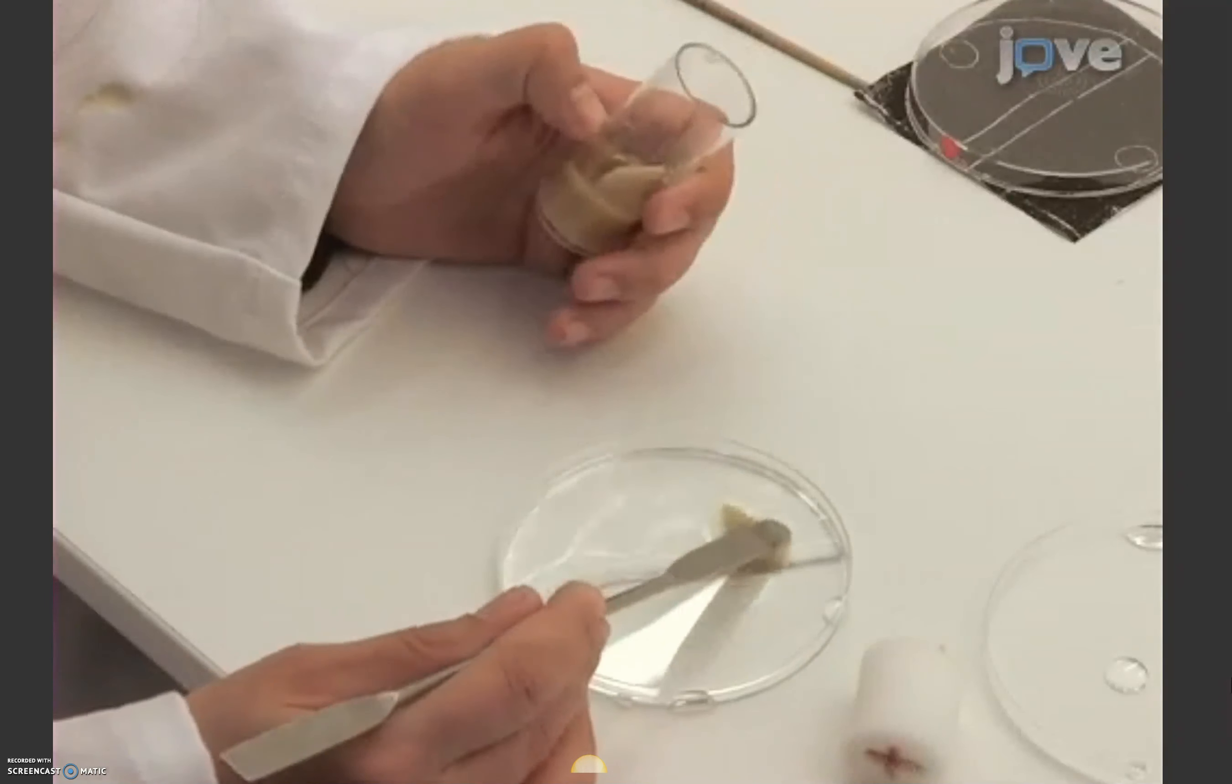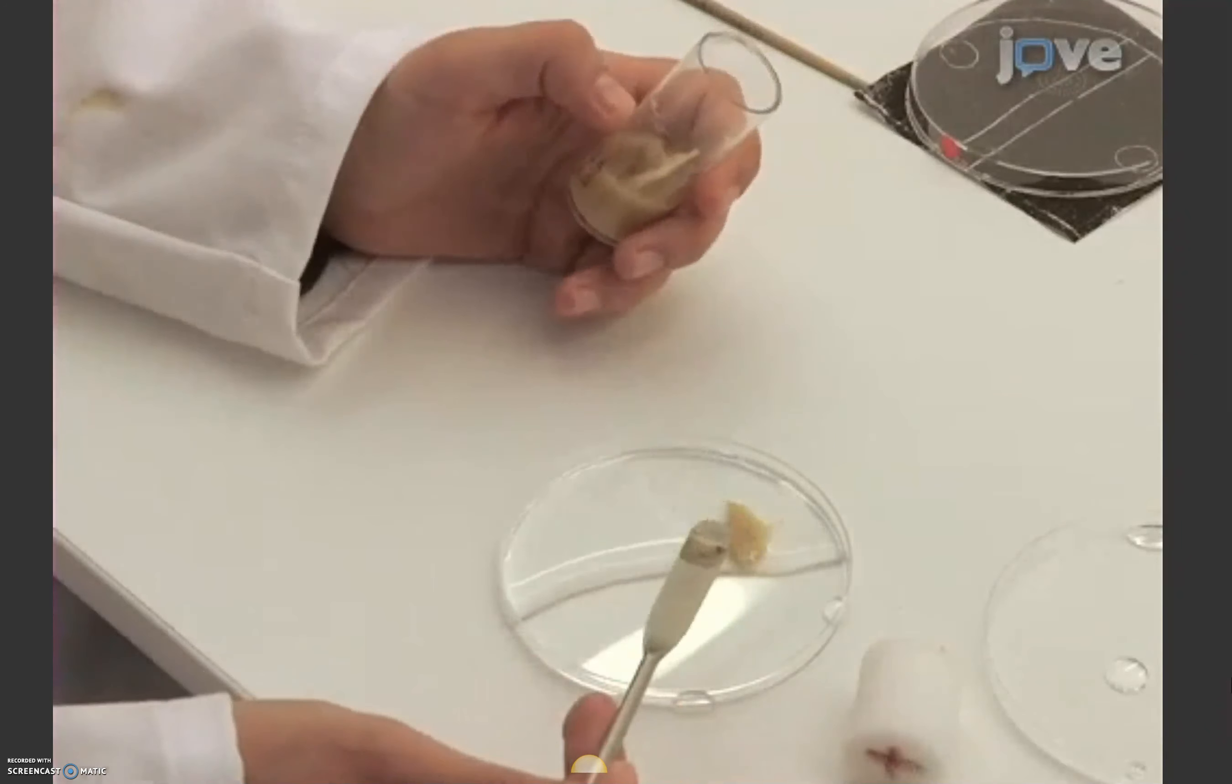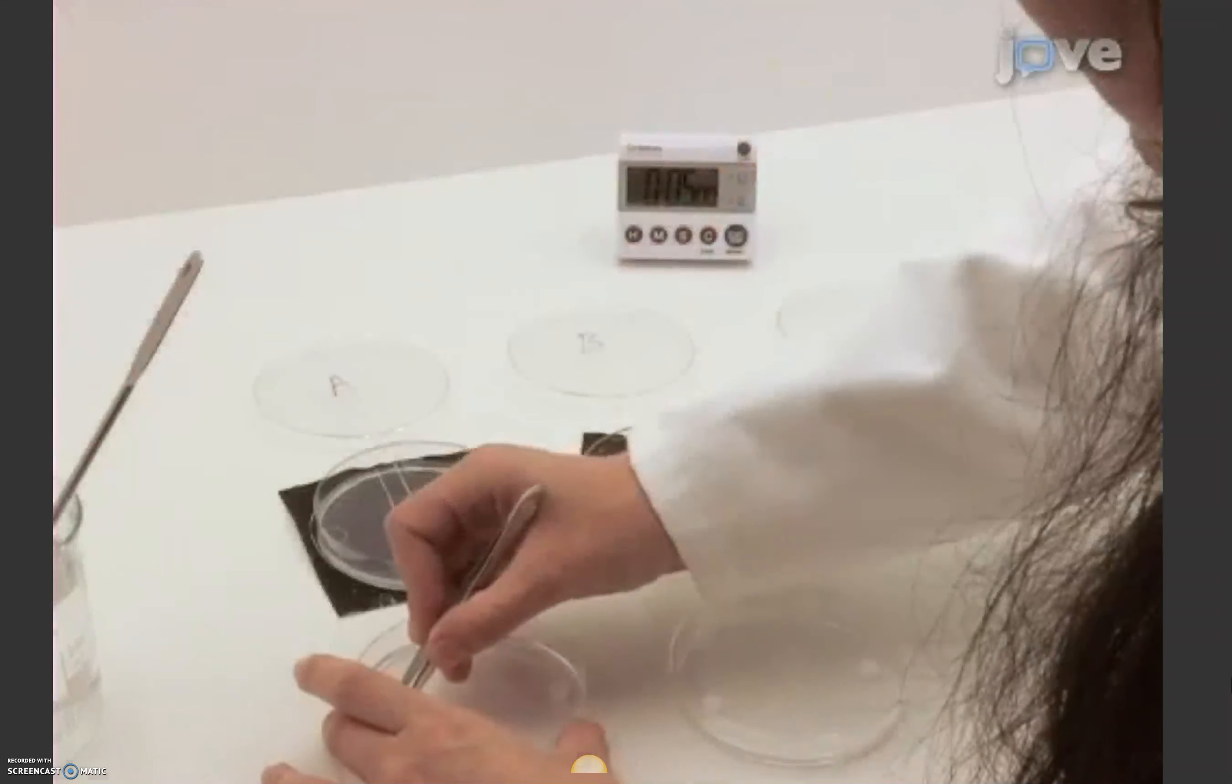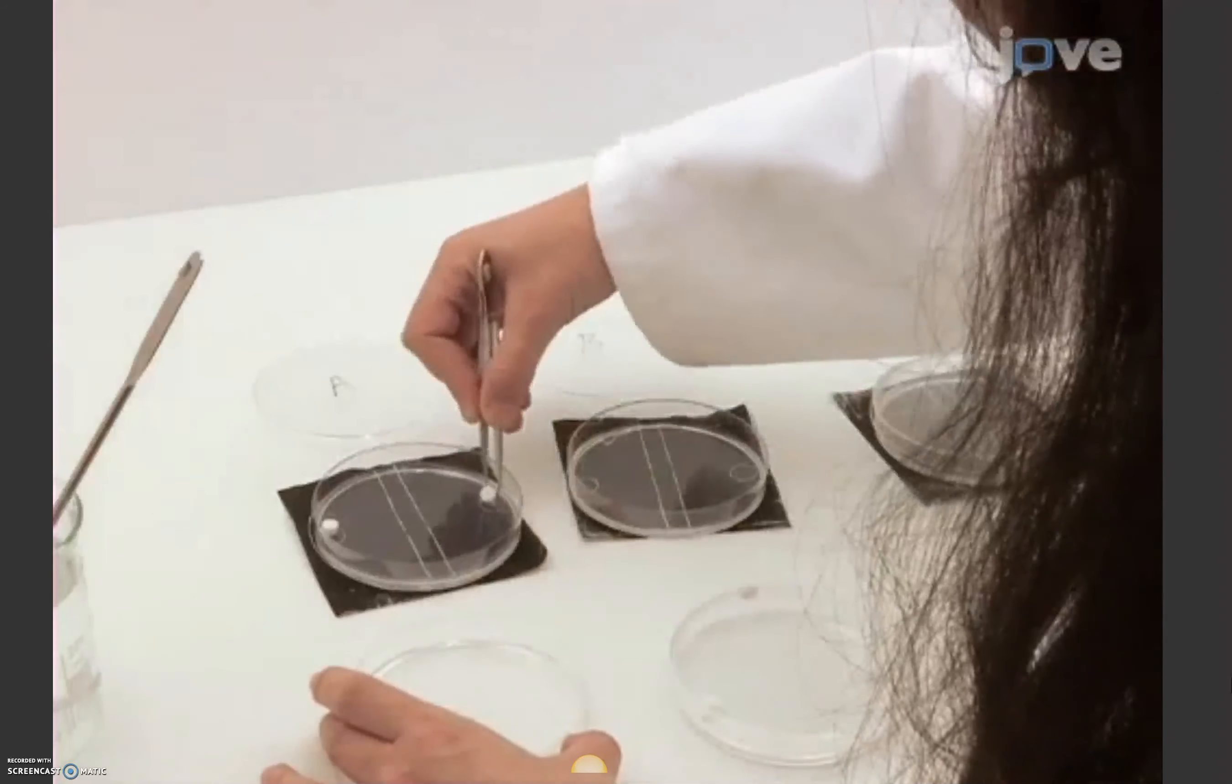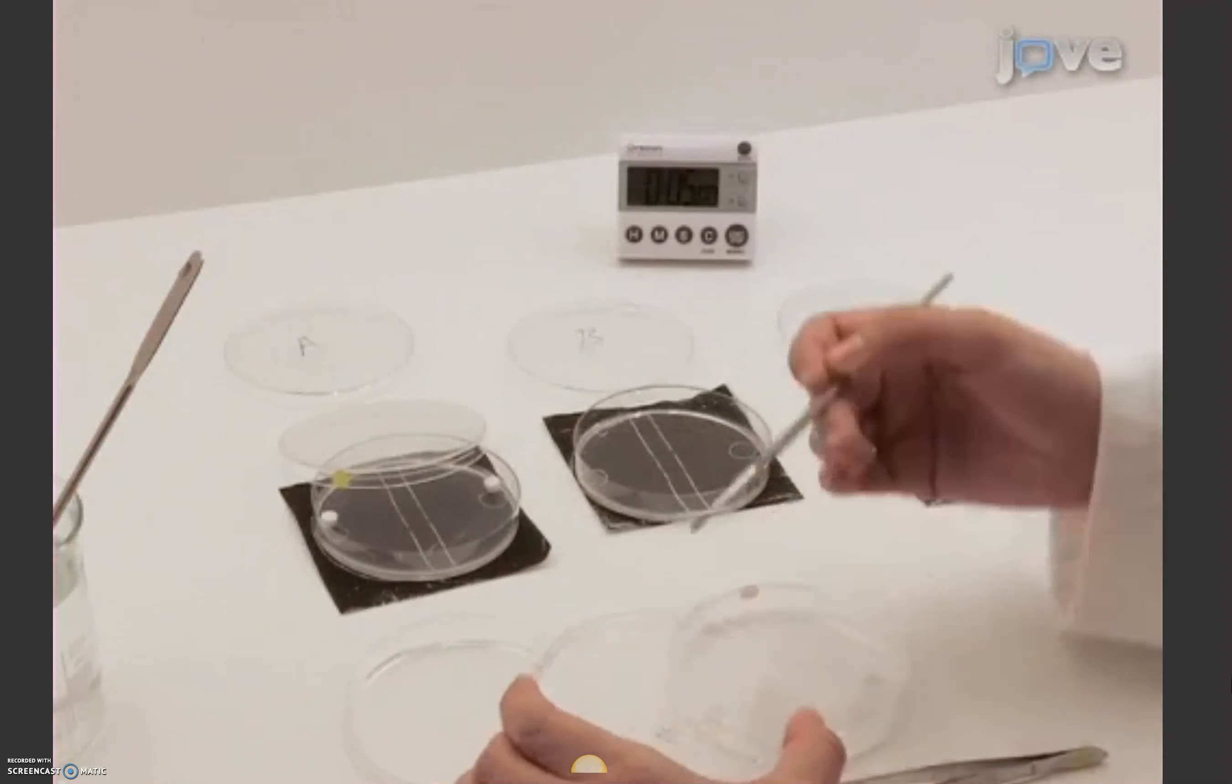Finally, to complete the experiment, select 30 new third instar feeding larvae and repeat the training and testing with the opposite combination of reward and stimuli. Continue using the same odor containers.